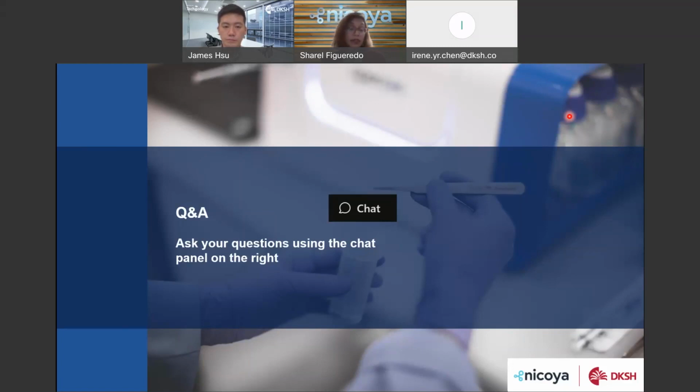Unlike the Open SPR, which is very easy to use, any scientist, whether it's a grad student, a postdoc, anybody can use that instrument. You don't need specific skills to use the machine. We would teach our users assay development and optimization, and that chemistry is what we would need to train them on.